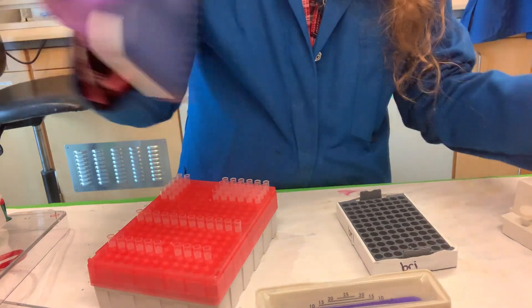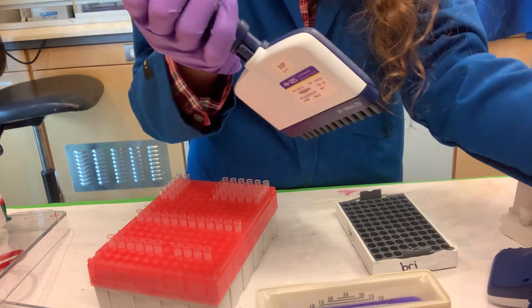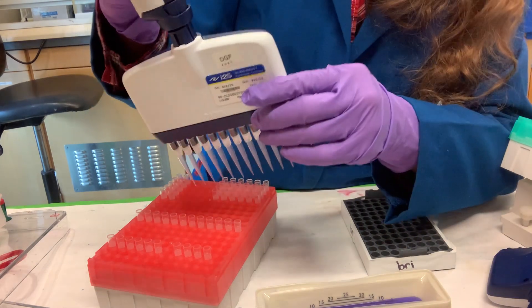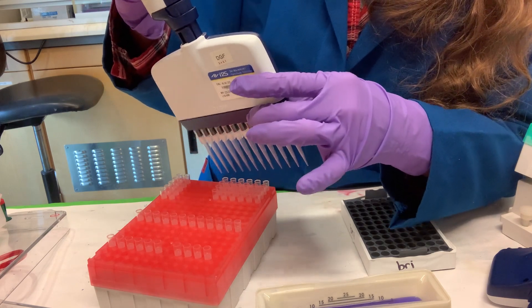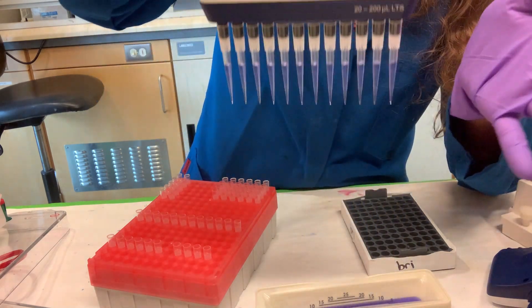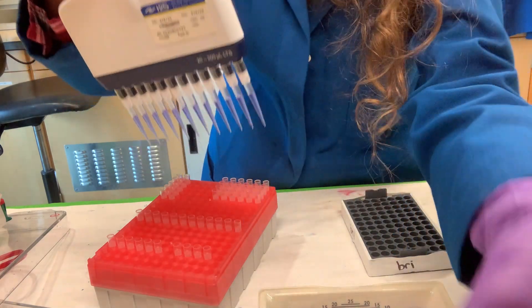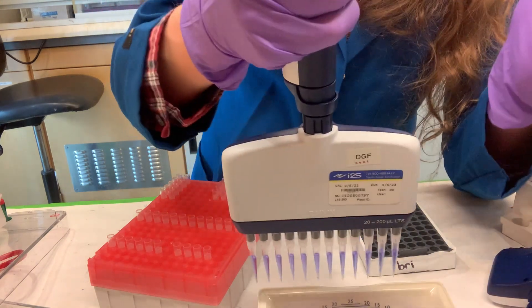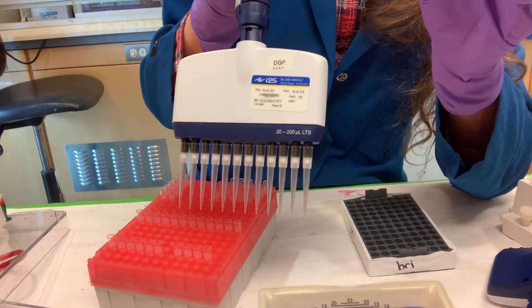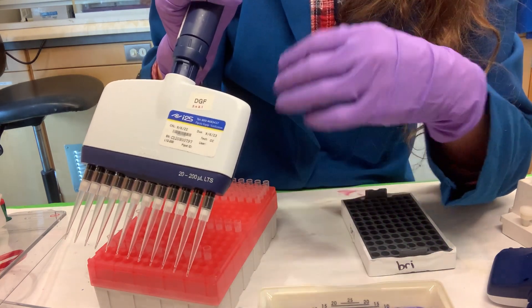You can use different size multi-channel pipettes depending on how many samples you have and what volumes you need. For example, with a 200 µL multi-channel, you can aspirate up to 200 µL — say you want to do 100 µL. It's easier to see that things are level when you have a larger volume, and it's easier to avoid bubbles. But you don't always have that larger volume, so you have to be really careful with small volumes, because every little difference matters — any liquid stuck in the tip or on the outside can be problematic.